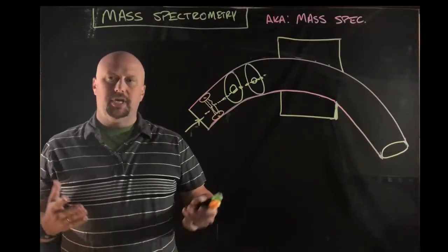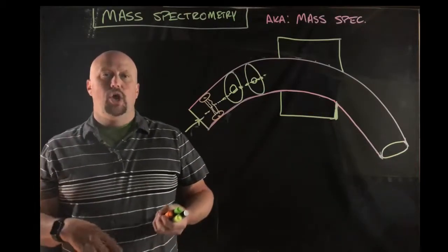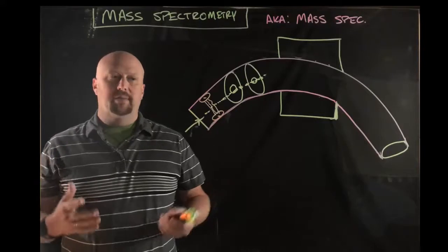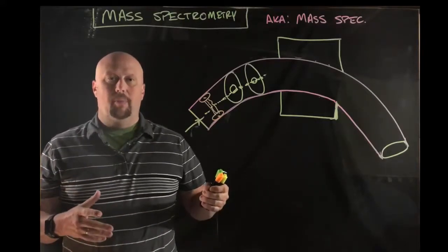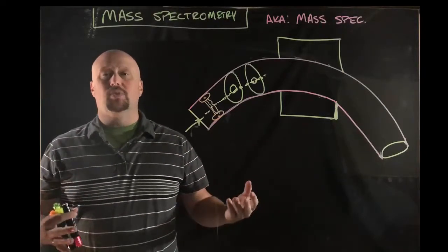Mass spectrometry is one of a bunch of different techniques that as chemists, or really scientists, we use to properly identify what molecules are, whether they're just single atoms and we're trying to find isotopes, which is the stuff we'll talk about today, or whether it's like you're watching CSI and they pop the stuff in the machine and it spits out an answer. Of course, it doesn't work quite that easily.